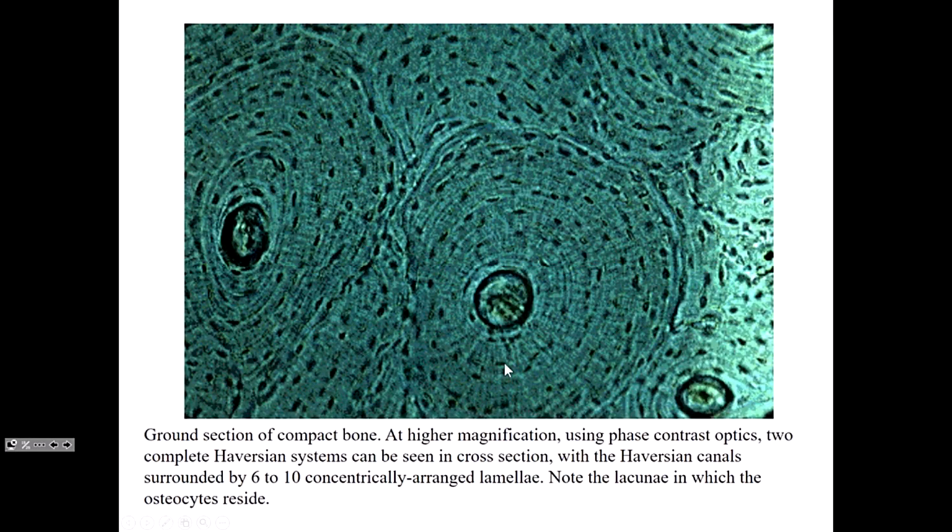Okay, here we have some more osteons, much more mature osteons. Here's our canal, osteon or Haversian system, whatever you want to call it, same thing, Haversian canal. And here we have these interstitial lamellae. So this is an old osteon, an old Haversian system that has been partially digested, and this is a piece of the Haversian system that's left over.